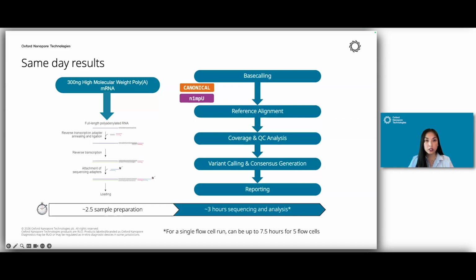As I mentioned earlier, we are looking at the RNA directly. We do this RT in order to confer some stability, but ultimately, because the nanopore sequencing adapter isn't attached to that cDNA strand and it doesn't attach to the motor protein, we are reading only your molecule of interest, and that cDNA strand does not get sequenced.